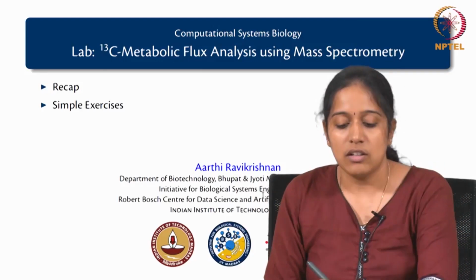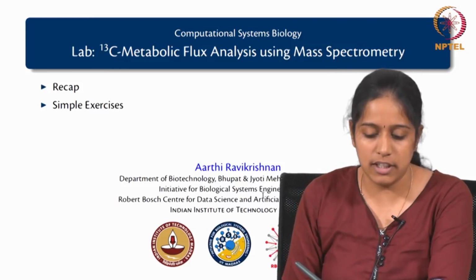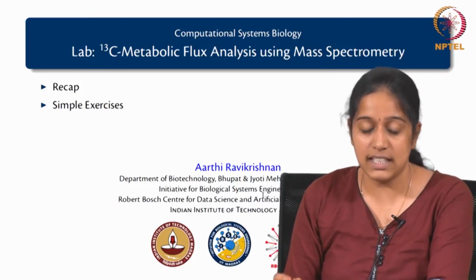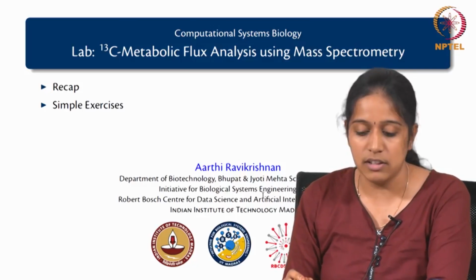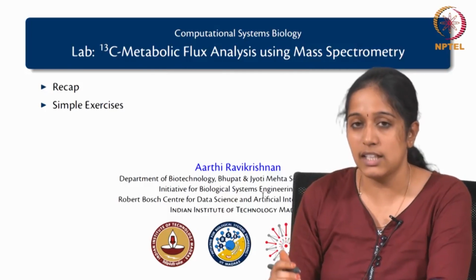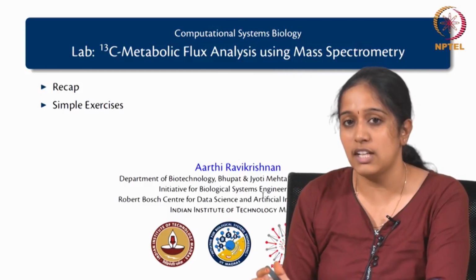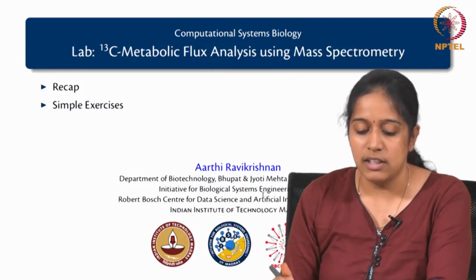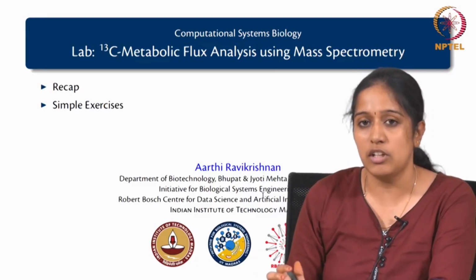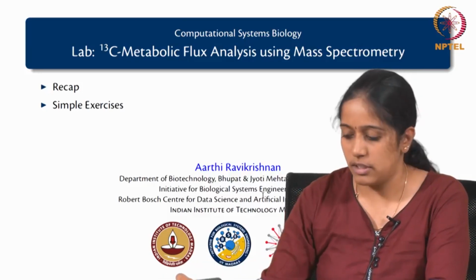Welcome to this session on C13 metabolic flux analysis using mass spectrometry. In this session we would be handling a few examples. So, this would be a lab session where you would get a flavor of what exactly is the kind of data that is being handled in metabolic flux analysis using mass spectrometry, and also have a few ideas on what kind of problems can be solved using C13 MFA using mass spectrometry.